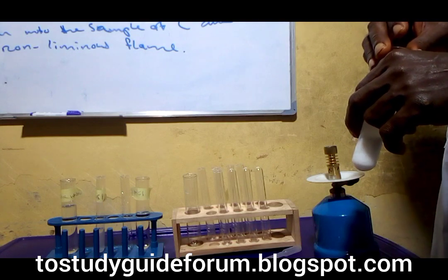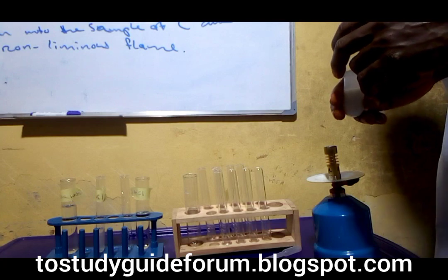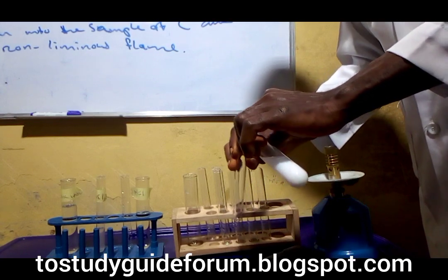Now the next one said that we should add, to the mixture from 2 above, dilute hydrochloric acid. So the next thing we are going to add is dilute hydrochloric acid. We need to reduce the volume.